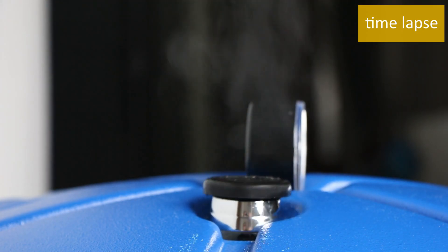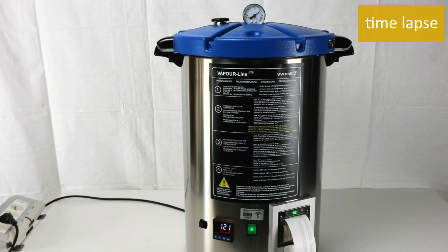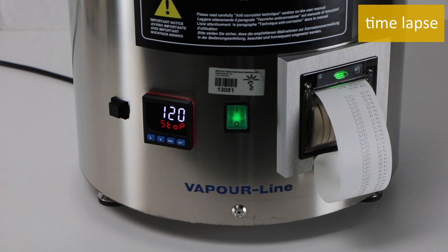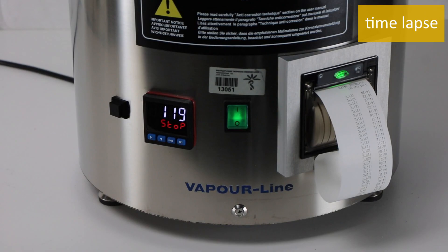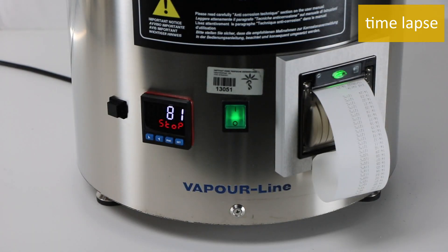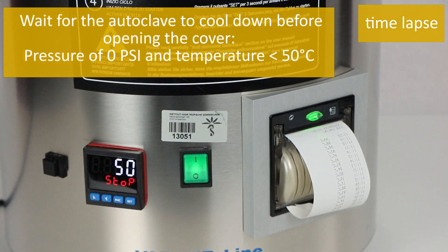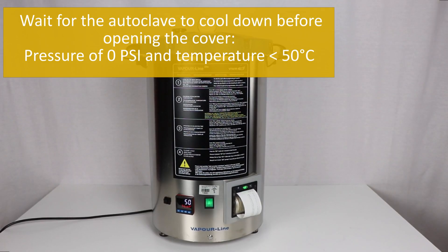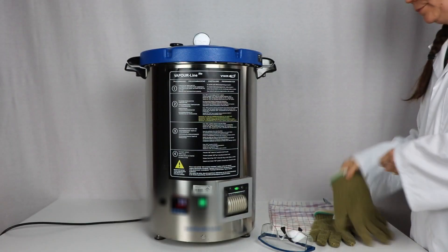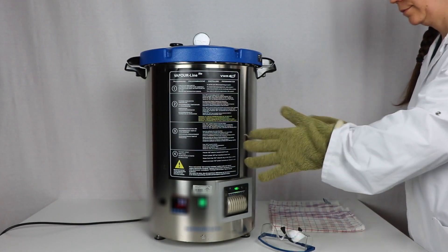An acoustic signal lasting a few seconds indicates the end of the sterilization cycle. Stop and A1 are shown; next, A1 disappears and only Stop is shown. The actual temperature will decrease until room temperature. Wait for the autoclave to cool down before opening the cover. Pressure of 0 psi and temperature of less than 50 degrees Celsius is required before opening. Protective glasses and heat resistant gloves are required before opening the cover.